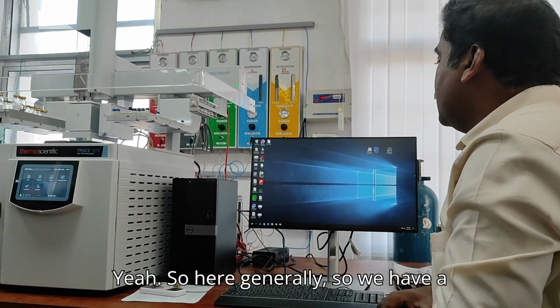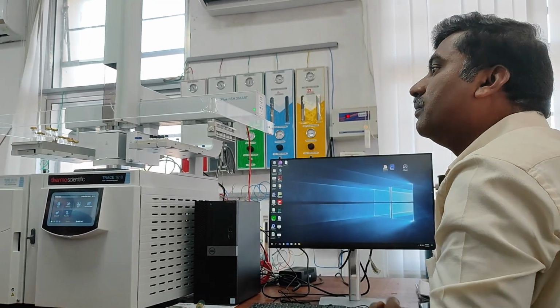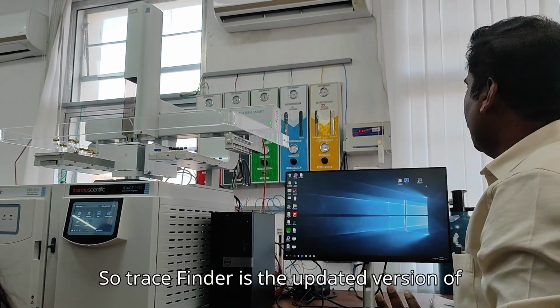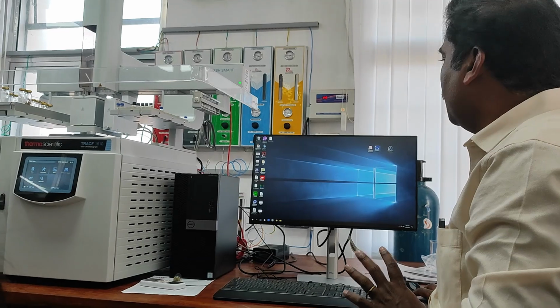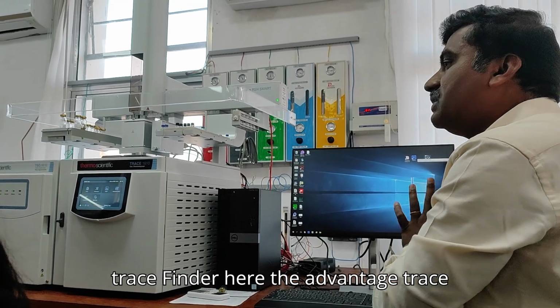Generally, multiple different types of software can be used for instrumentation injection. Here the software are called Excalibur and Trace Finder. Trace Finder is the updated version of Excalibur. So these are not two different software. The basic software is Excalibur, and the updated package of Excalibur is Trace Finder. Here is the advantage in Trace Finder.